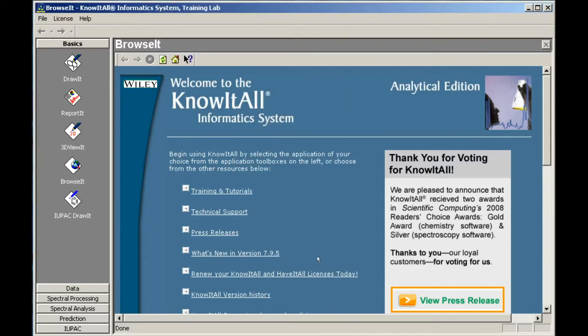The name of the User Edition is displayed in the window title bar. Next, we'll add another application to the Basics toolbox.